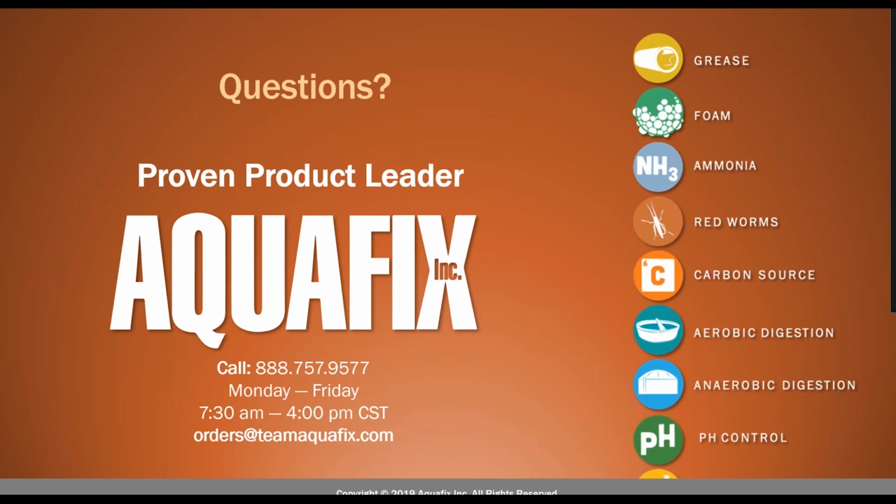So how many times per week should one be doing a microscopic examination? I think that really depends on your treatment plant and how stable your treatment plant is performing, so it really would be variable. But I don't think it's something that you would need to be doing every single day or multiple times a day or anything like that. But I think a couple times a week should be sufficient if everything is running well at your particular treatment plant in regard to a microscopic examination on site.